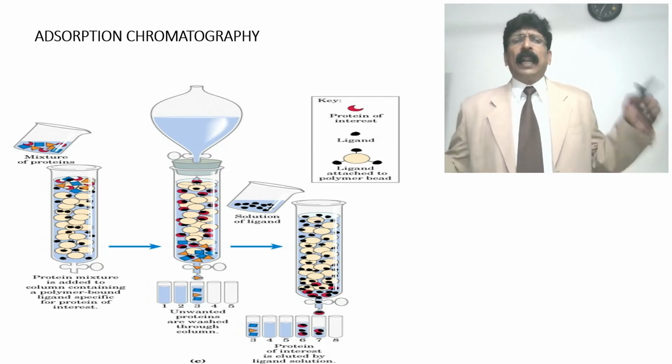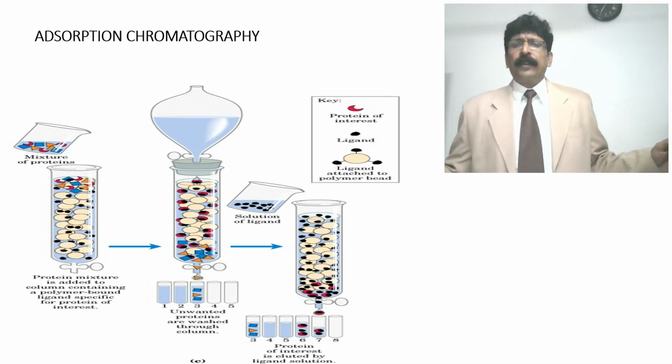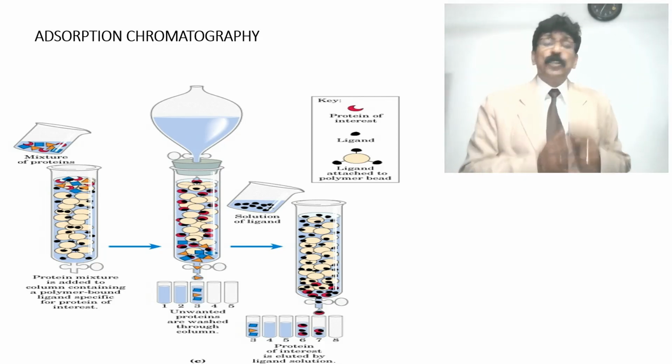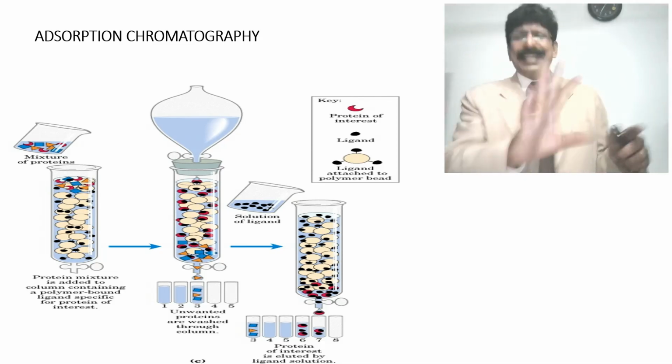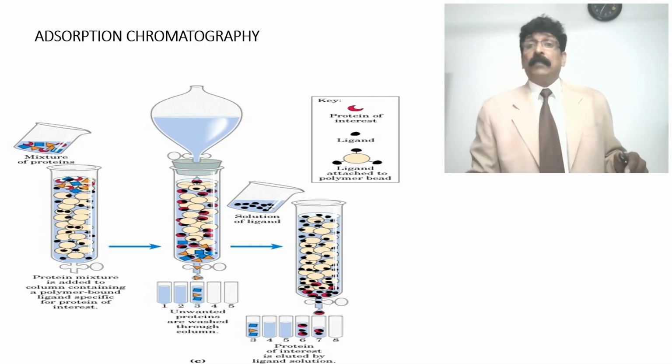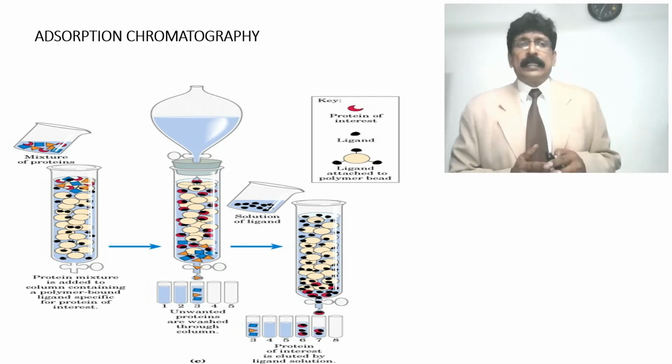Basically, in adsorption chromatography, how is the compound getting separated? This is a picture which I have taken, very interesting, to know about a mixture of proteins as an example. It is just a diagrammatic example to make the student understand.